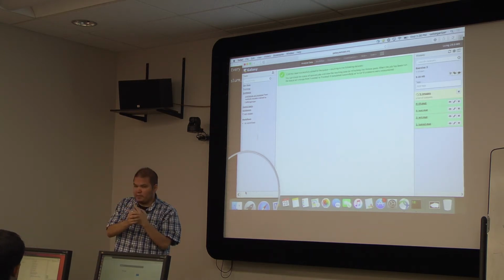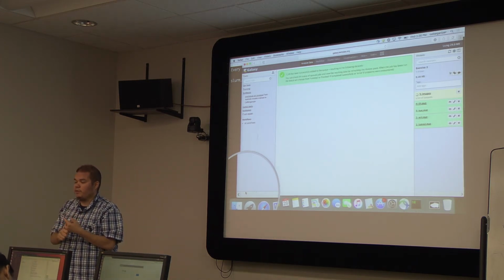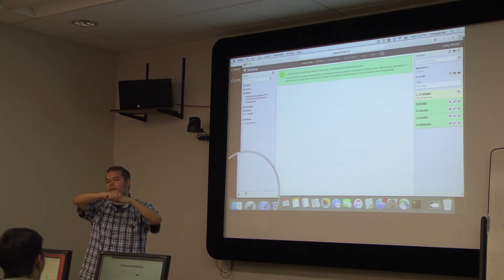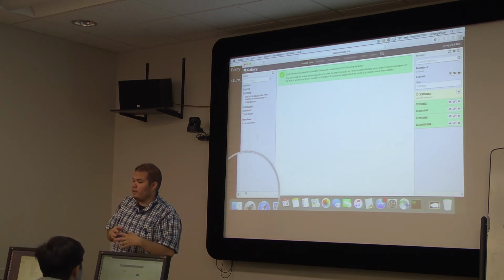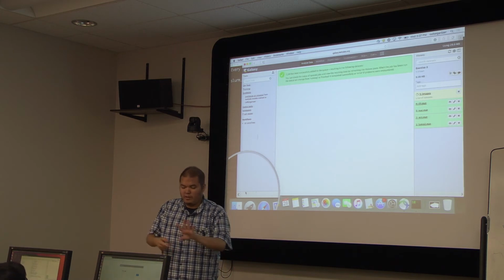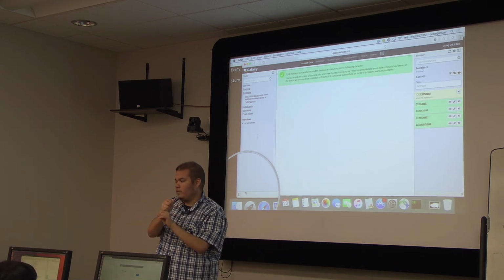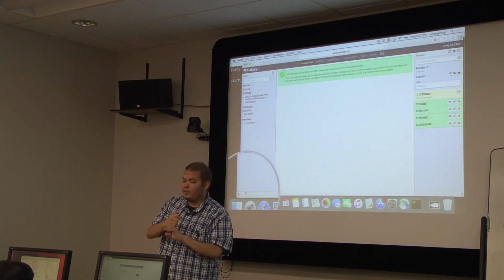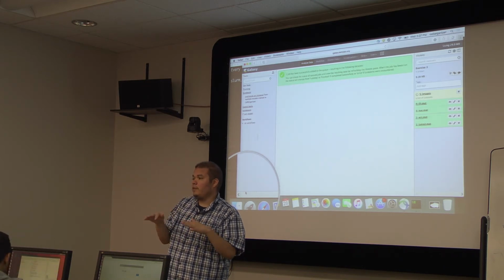Then we did exercise number 3, where we're trying to synthesize with more than one model. That's fairly trivial because we're using one of our canned models. So what is the next step? Next step is jumping into the diffeomorphic model, which is the model that we talked about this morning, which I think all of you are the most interested in. The reason why we did the first 3 exercises is so that you could see how we can import your own images to train a model, and how you can synthesize an instance when you get your file. Was that clear so far?